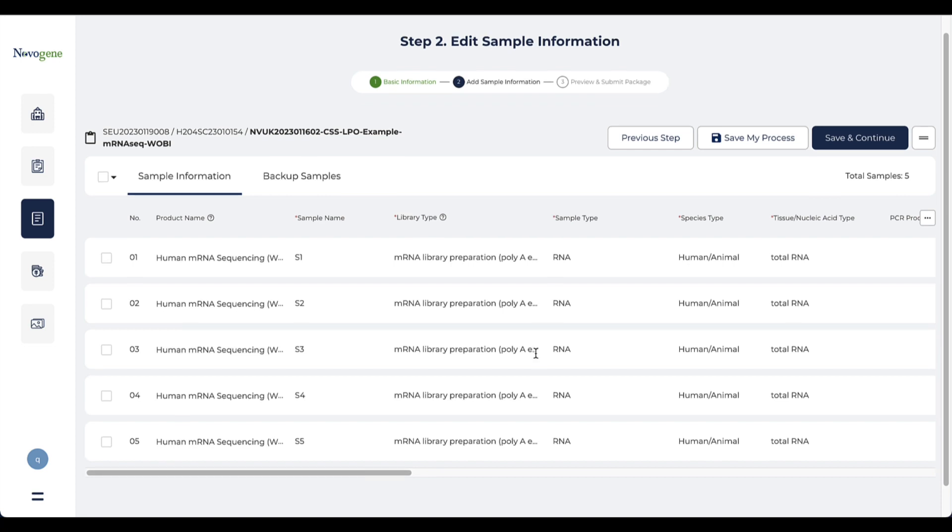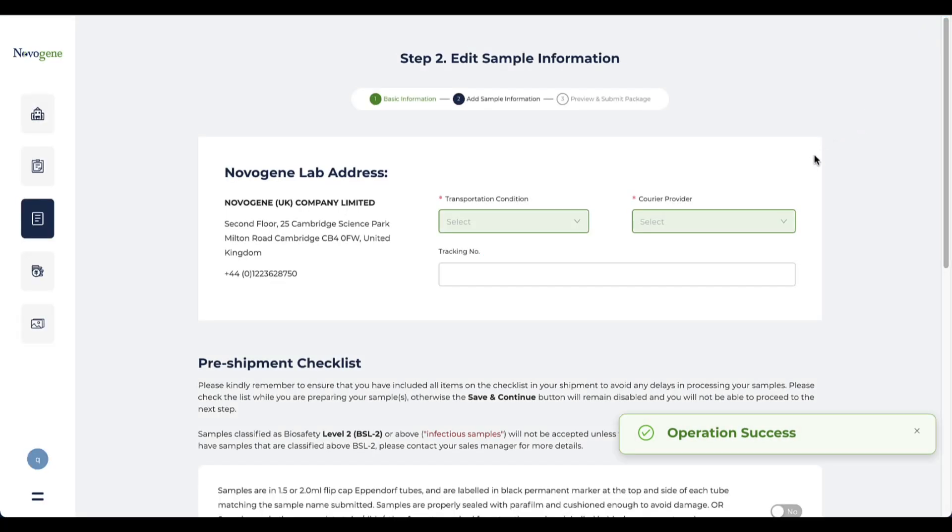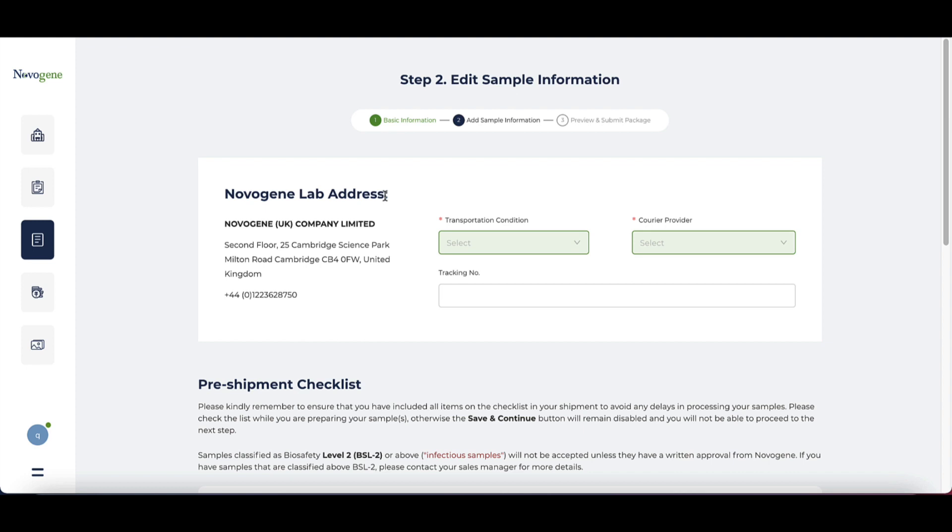After clicking continue, you will be directed to an overview page. The information is all prefilled based on the quotation information or the information you uploaded. You can modify the information quickly if needed. Then please click save and continue to the next step.